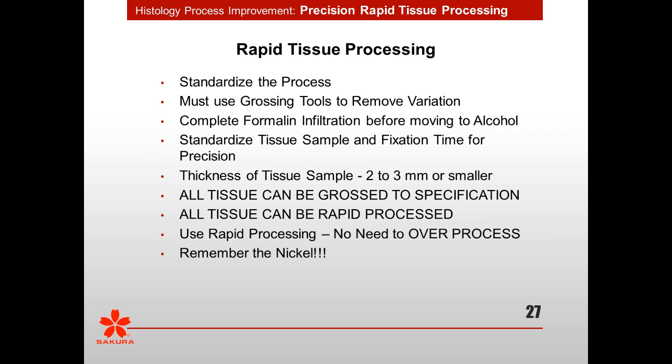Maybe it takes a little bit more time, maybe it takes a little bit more effort, but again, that gains you hours as you move through the rest of your process, whether it's taking it off of your tissue processor or how you're cutting, the consistency and the efficiency that you gain. All tissues can be rapid processed. Now remember that if you move away from any FDA-created protocol, you must do a validation study to show that you can produce the same results, but all tissues can be rapid processed. I think that's been proven for years now, and it is something that you should look at so that you gain more time into your histology.